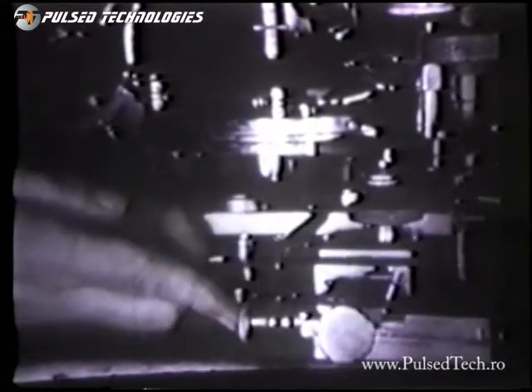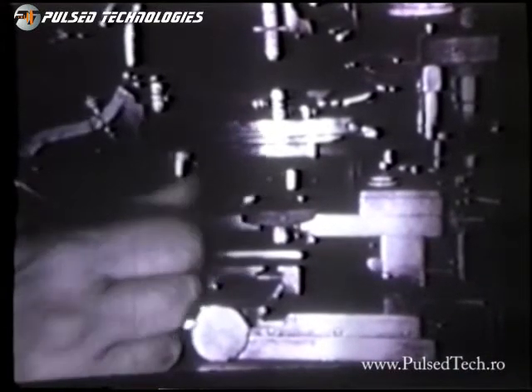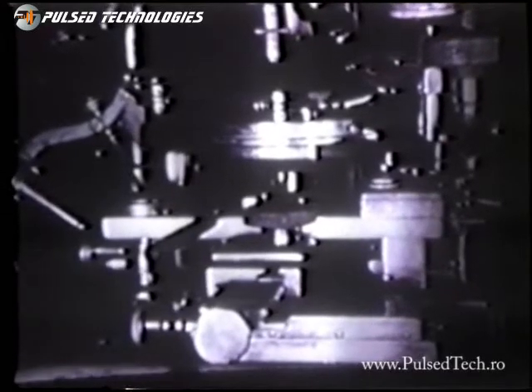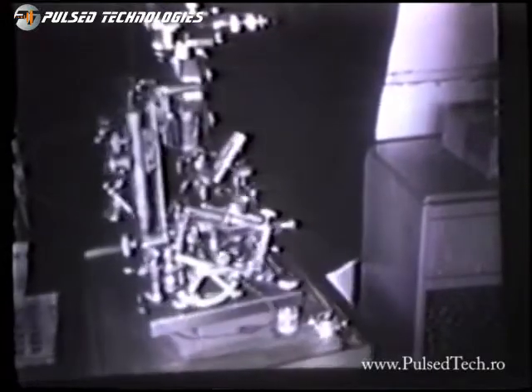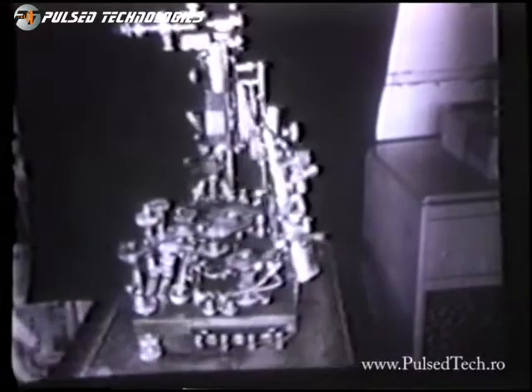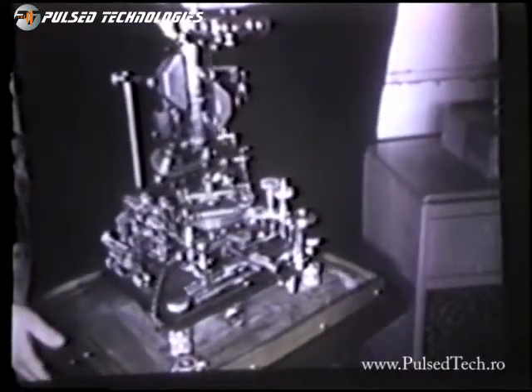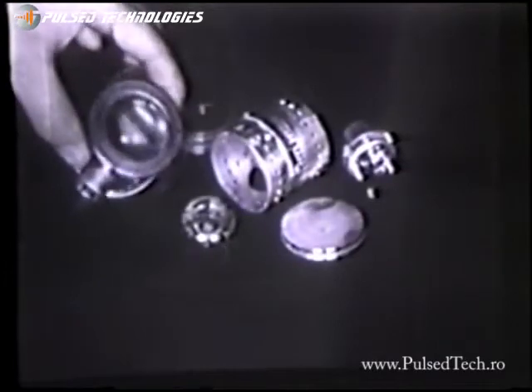The lights underneath the base of the microscope could be moved back and forth to use different types of light, such as infrared, ultraviolet, monochromatic beam light, and any other light that was desired. The microscope had prisms that went through both sides of it.